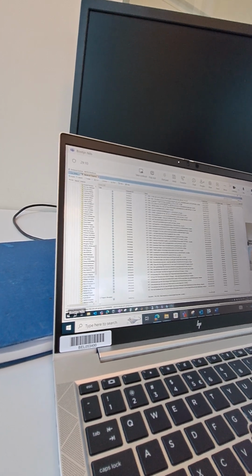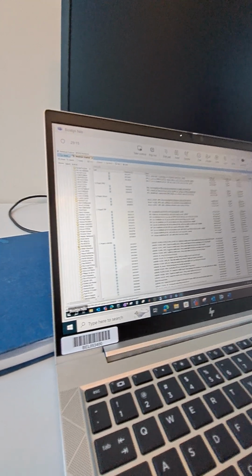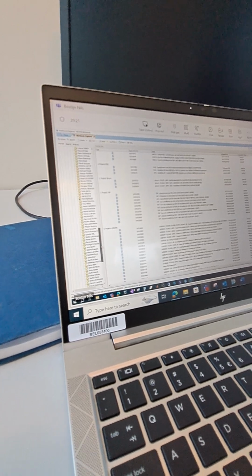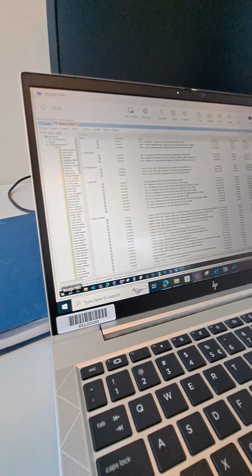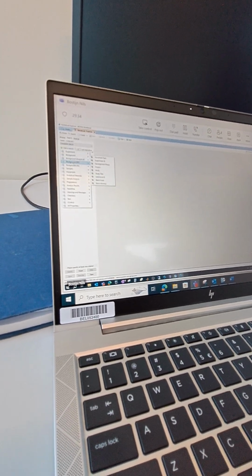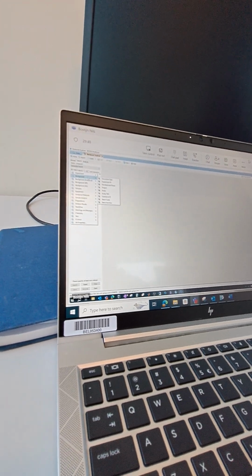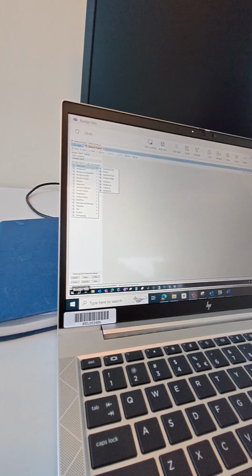So for the quick search, we can type it in at the top. Yes, that's also something you can do. You can go to the name of a person, or just type in the word. Then you can do a search. You add a search, and then here you can select what you want to search on, like background or experiment title equals.